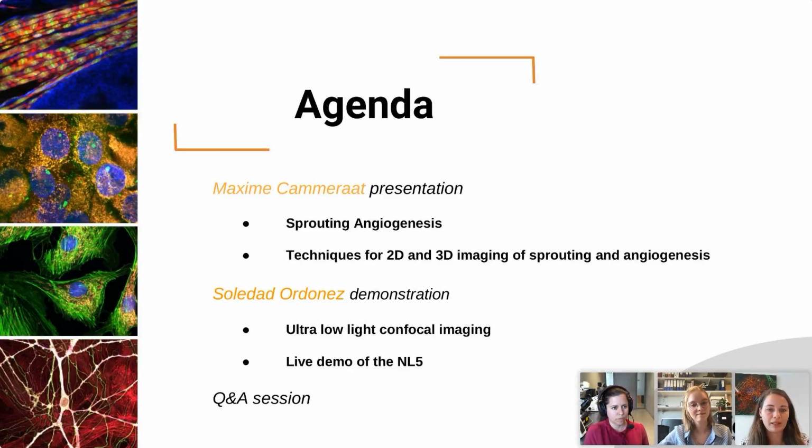This will be followed by a presentation and a demonstration by Soledad Ordonez, who is our new product application specialist, who will talk about the applications and the specifics of NL5, and then give a demonstration on the system and show how we can image such processes and structures with our fast confocal system. And this will be followed by a Q&A session where you can ask your questions.